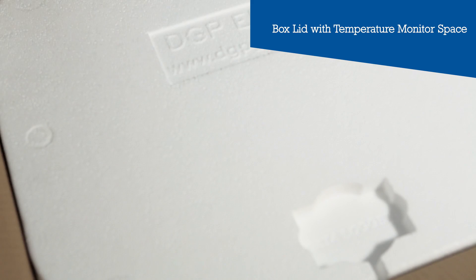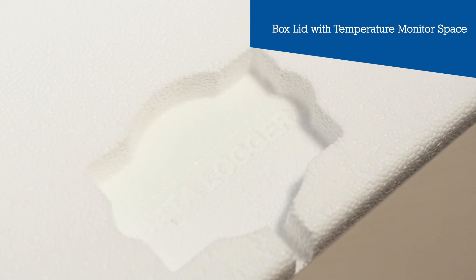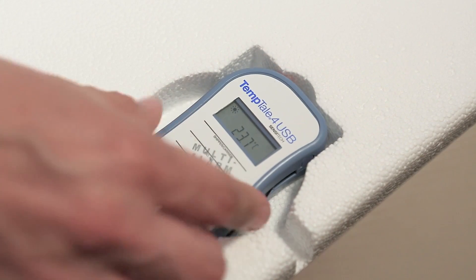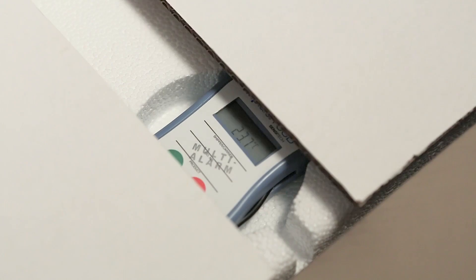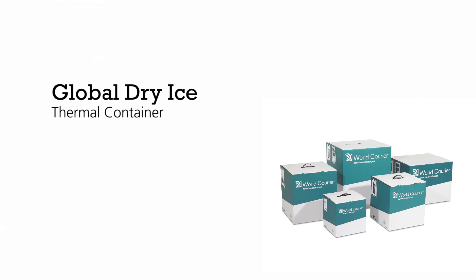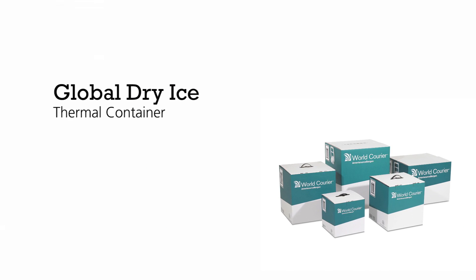The parcel is sealed with a thermal lid and if desired, an additional external temperature monitor can be placed securely into the cut-out space. This can also be used for a probed temperature monitor. The box is then sealed and ready for shipment.